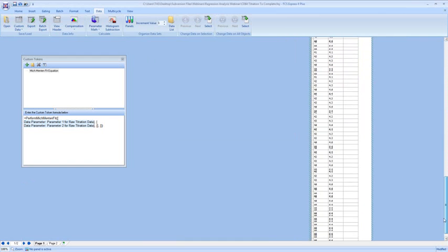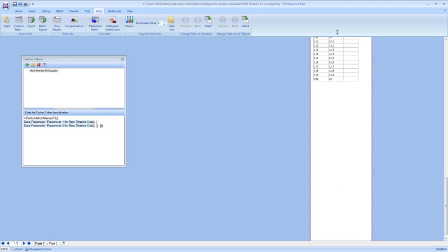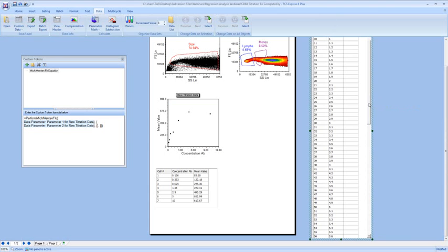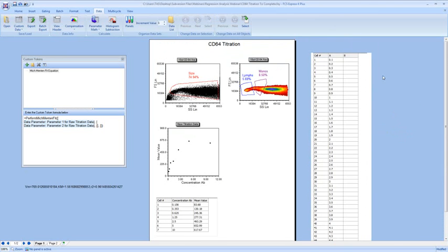So let me make this custom data a little bit smaller so we can see everything that's in here. But the idea is we're going from 0.1 to 12 in increments of 0.1. So what we can do now is use our parameter math again to calculate all of the y values for these based on the x value that's there.